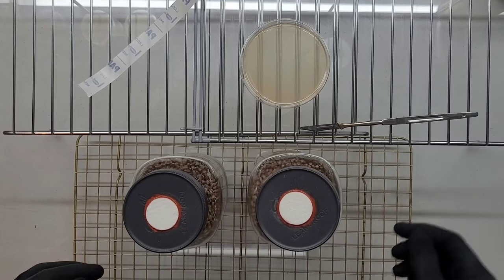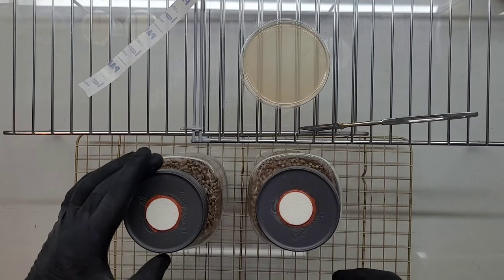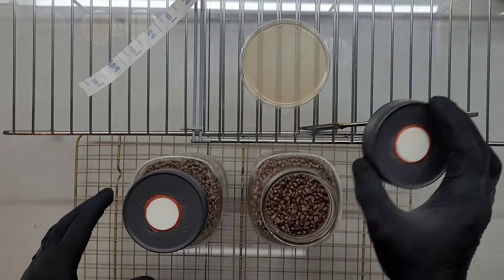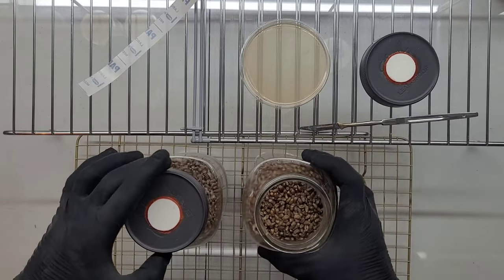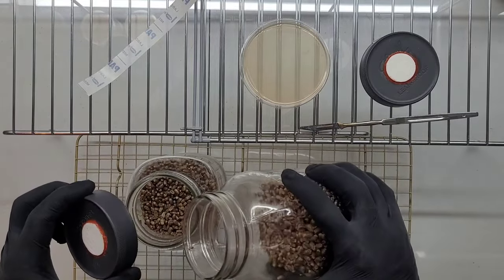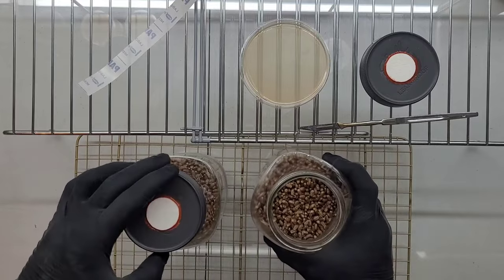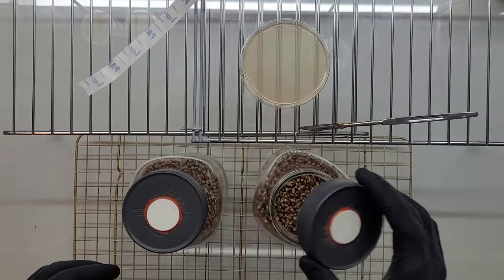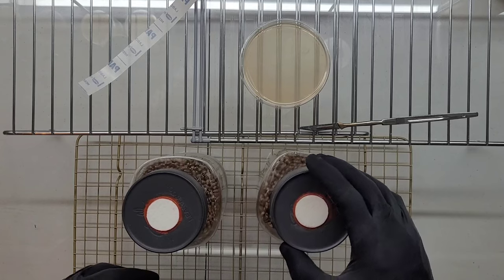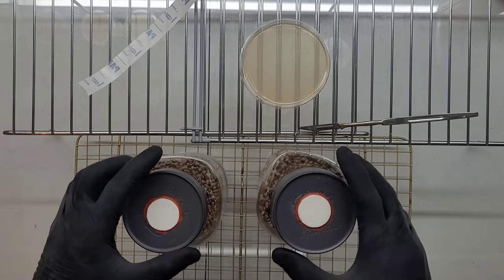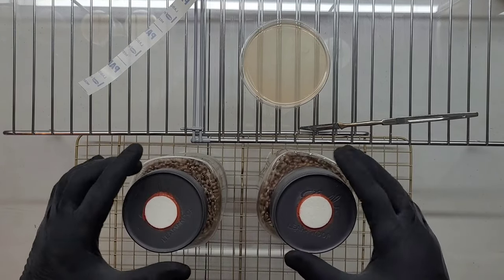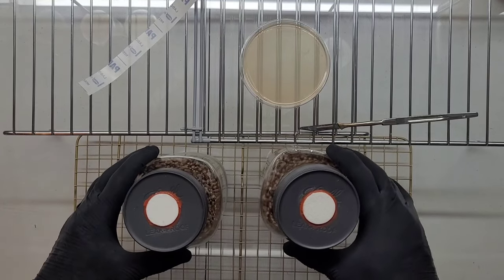Close off your jars by tightening the lids. Give it a good shake and allow time to colonize. Now grain-to-grain can be done inside of the still air box as well. Simply remove the lid, open the lid of the receiving jar, dump in your myceliated grain, close up, close your master jar. If there's anything left over, give it a shake and allow time to colonize at room temperature on your shelf.